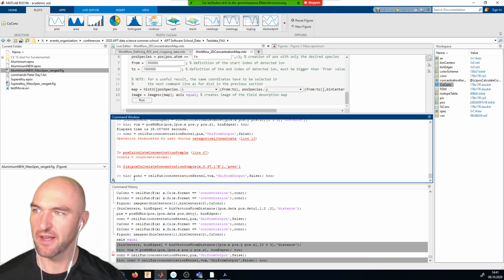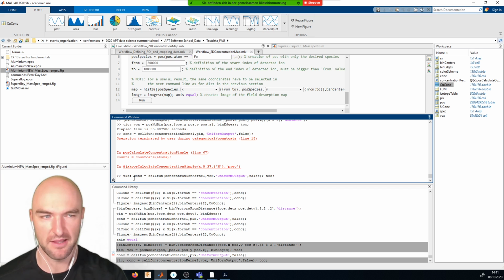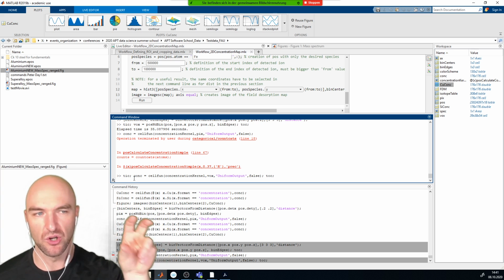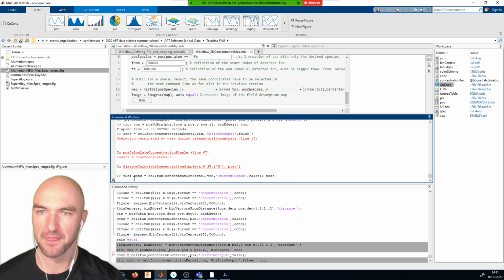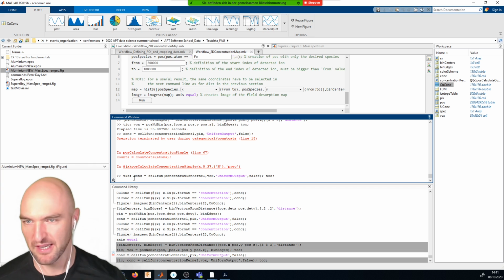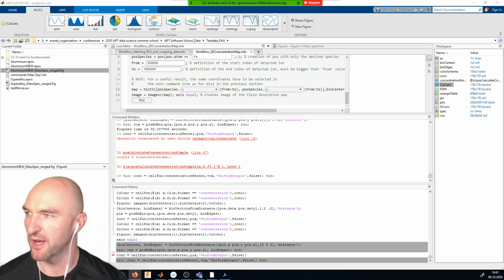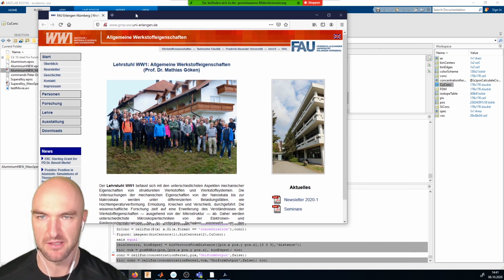And this is something that can be calculated much, much faster than applying a concentration function to each of the individual cells. Okay, which means while this is calculating, obviously with the voxelization we are going towards calculating isosurfaces.